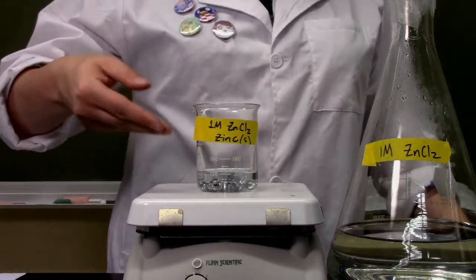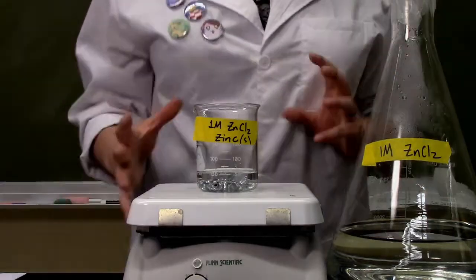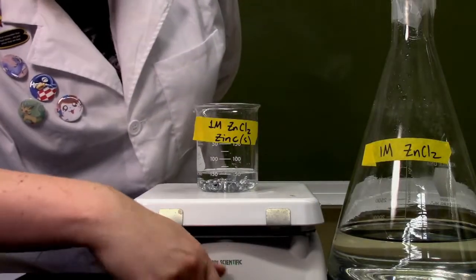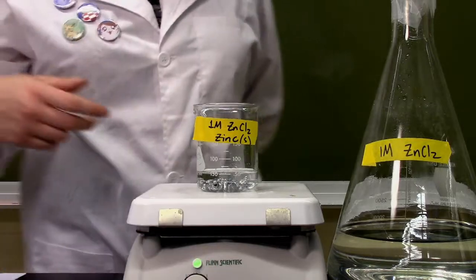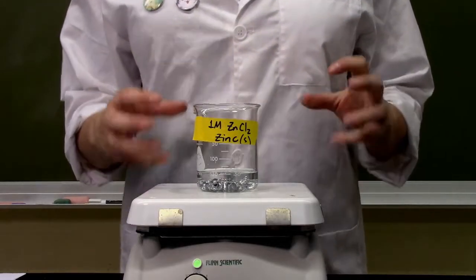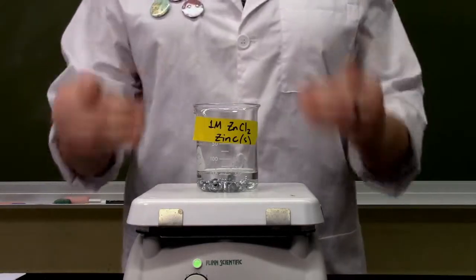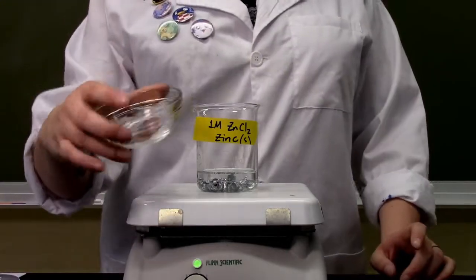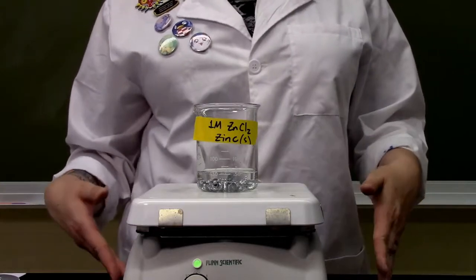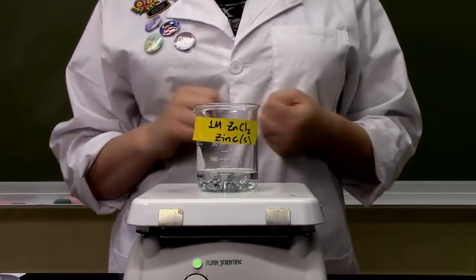Now we see that we have liquid on top and the solid is still down at the bottom. Now I'm going to be very careful to not touch my hot plate because I'm actually going to turn it on, and I'm going to turn it back on to that medium-high setting, about over here, and I'm going to let this heat up. We are now going to let the solution boil. Once it starts to boil, I will add 2 of my 3 pennies to this solution. Why did I give everyone 3 pennies then? Well, we want a comparison point. We want to leave 1 penny unchanged so that we can compare the color of the copper versus that silver versus our gold.